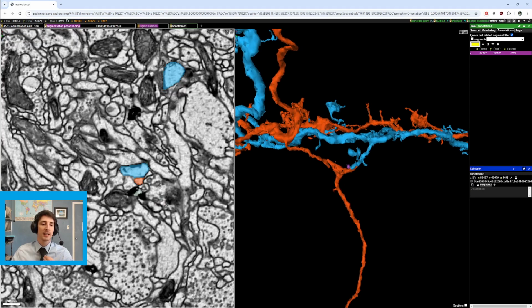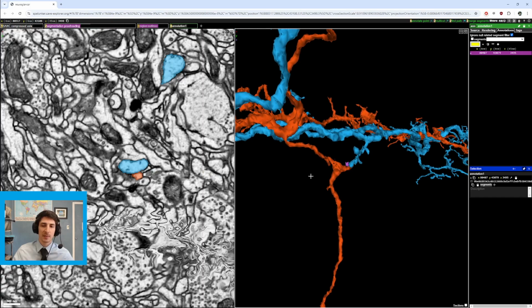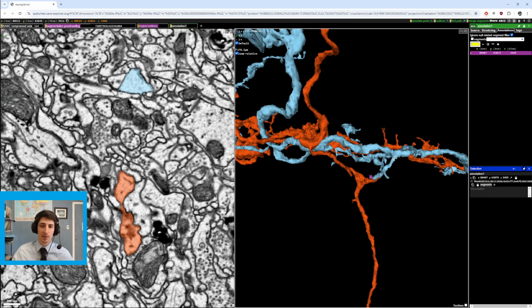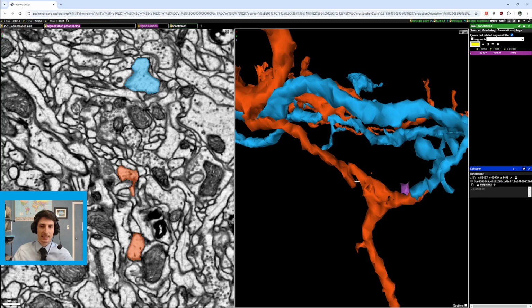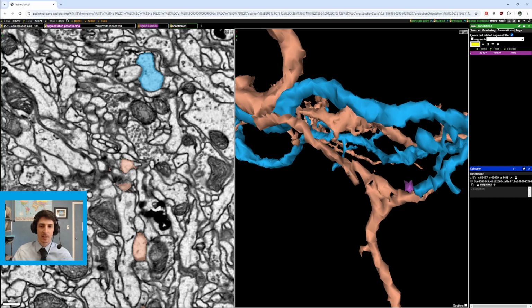So by checking our soma tract and knowing that our soma tract was good, and when I see this little triangle piece, and we know that things don't usually come off the soma tract, so it's a little suspicious, but it is early on in the soma tract. So we check here, and we can kind of see this branch is not exactly connecting to this. Like this is its own thing, and that's its own thing.